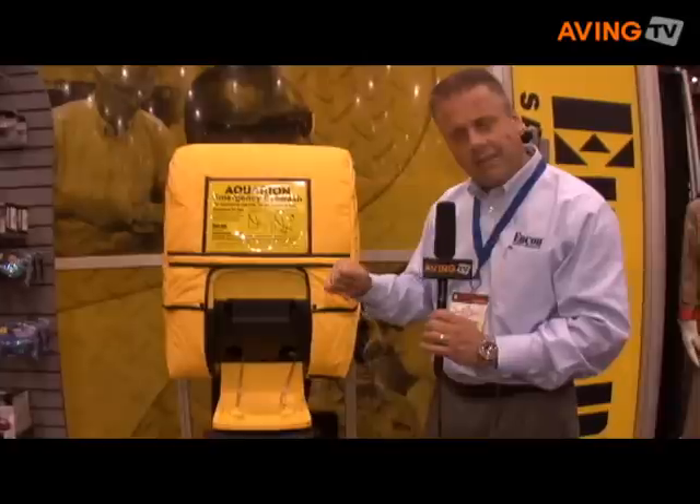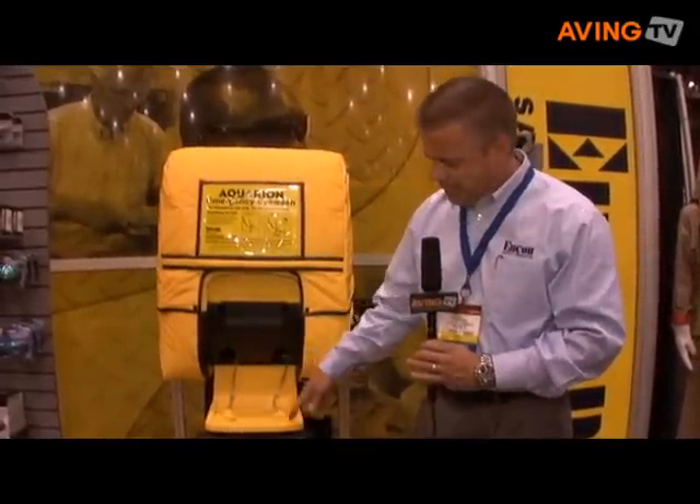Once it's been activated, you can take the two new cartridges, hang them back in there, run the lines in, and you're ready to go. It's as simple as that.